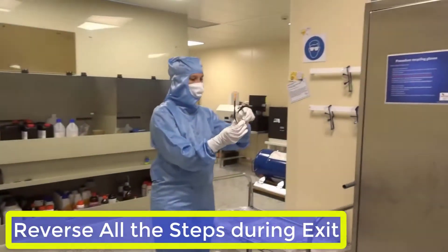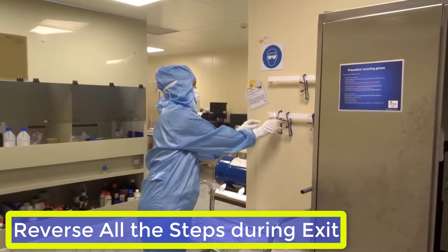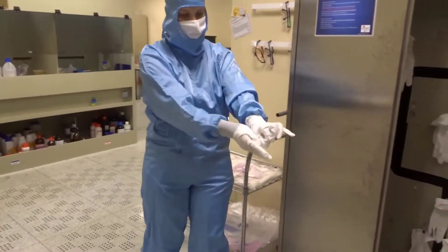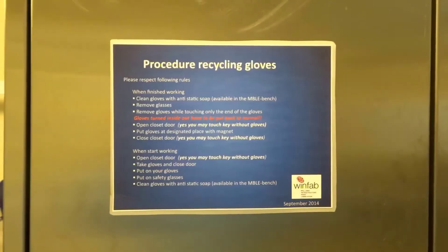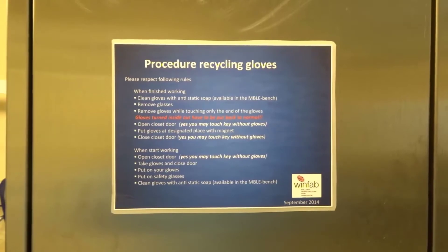When you have finished working, put back your goggles on the wall-mounted shelf, and recycle your gloves if they are still in good condition. You will find the recycling procedure on the cabinet's door.